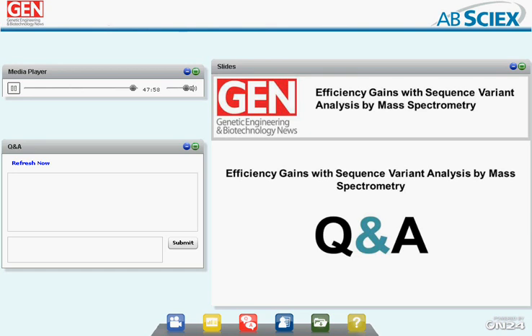Thank you, Stephen. And Jason, if you have a custom germline database, will you have a subsequent differentiation database for personalization? He's referring to slide 48. Yes, starting with the custom germline database, you can use the initial first pass of your search results to identify the type of family that leads to the germline. From there, once you identify some specific mutations, we then make a differentiation database to use as a template to base all future searches against, allowing you to localize even more somatic mutations.